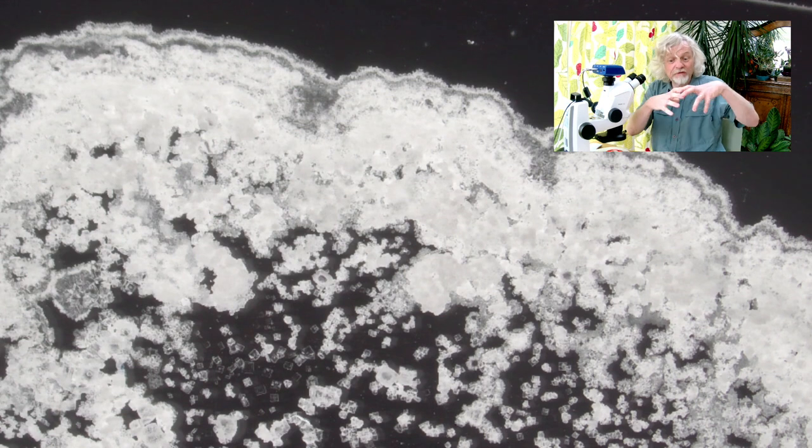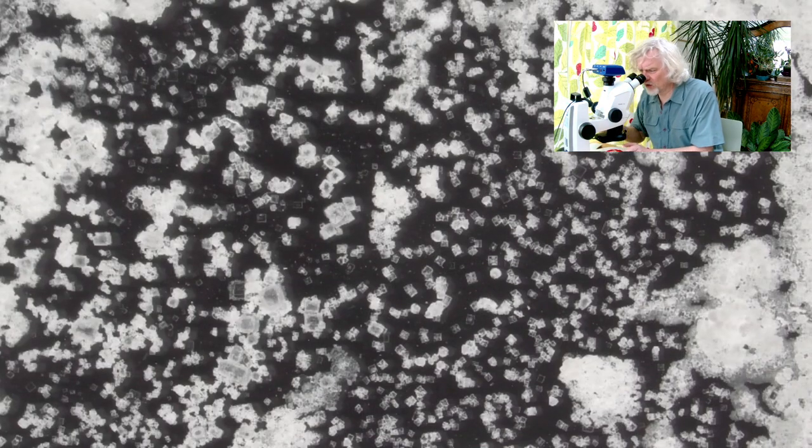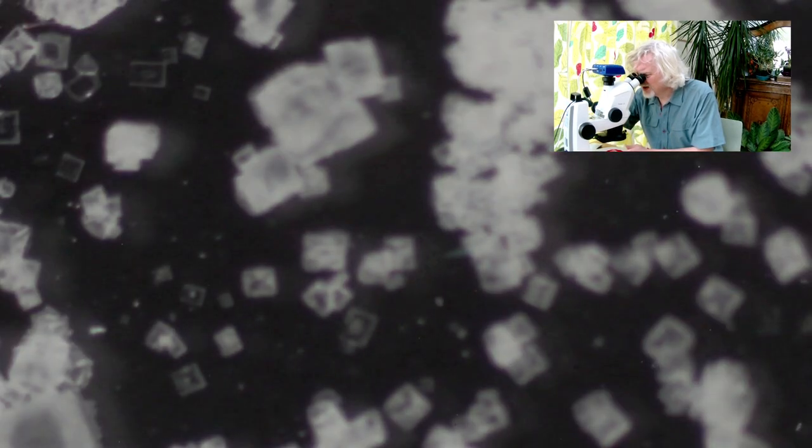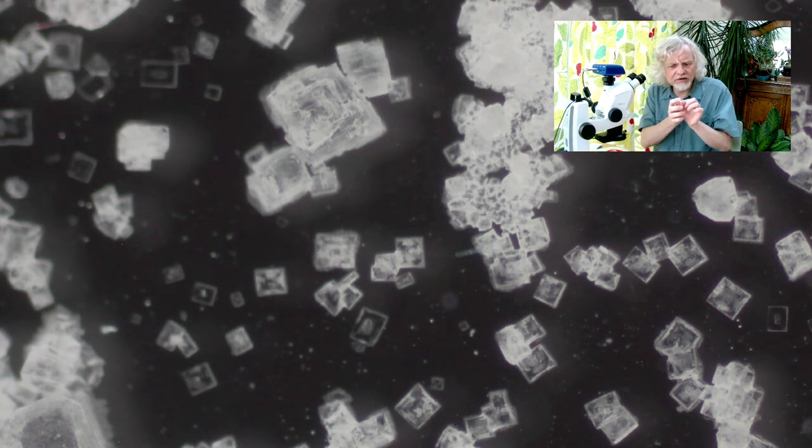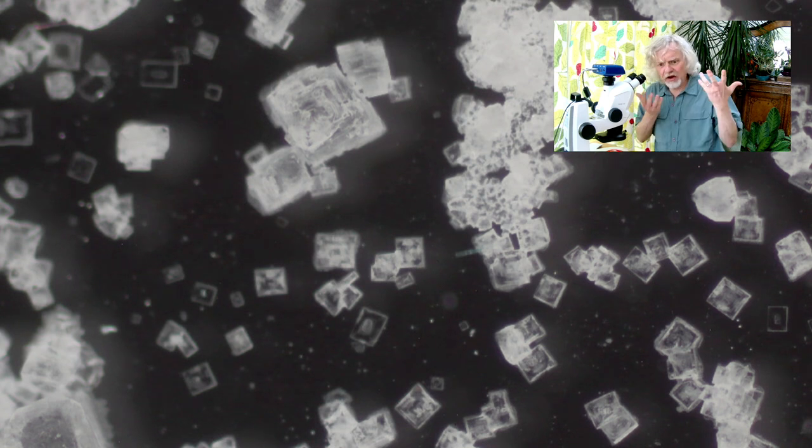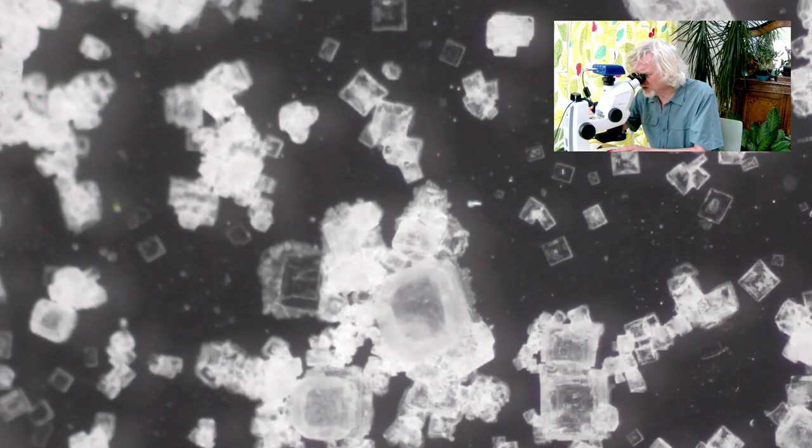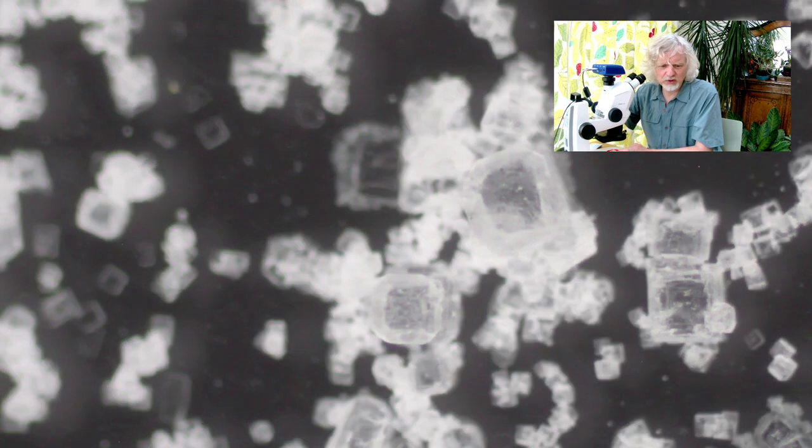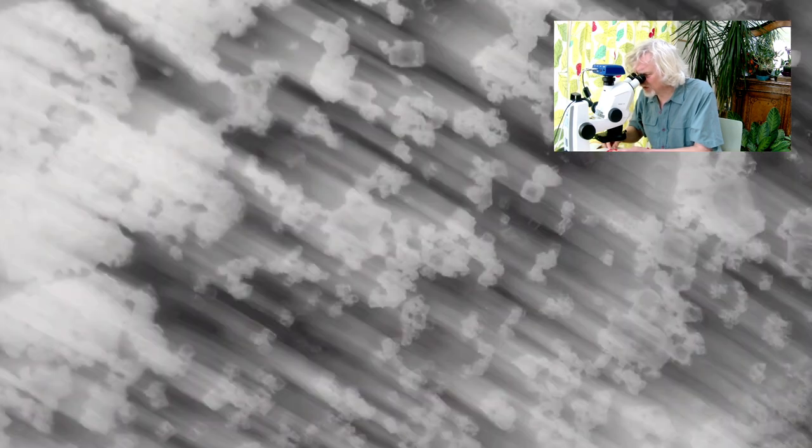So you can see, here's my sort of splat of crystals that have formed. It's sort of formed this sort of puddle, which has then dried out. It's all sort of crusty around the edges. But what I want to do is zoom in on the central bit here, which is sort of quite nice and clear. And if I zoom in on this bit here, you can see that all the crystals that have formed are indeed little cubes. I've formed these thousands and thousands of tiny little cubic crystals, showing us that this is the genuine kind of form that this crystal takes. This is just how it appears. And it's rather fun. And some of them are much bigger than others. We've grown some really quite big crystals there in the middle. Can you see them? They're sort of piled one on top of each other. I have to focus up and down to sort of see. There's the top of the crystal stack. And there's the bottom.